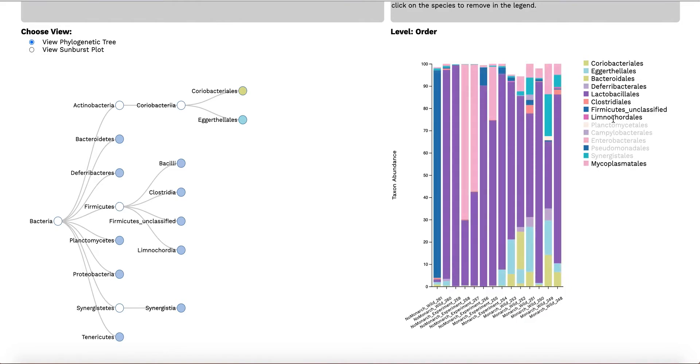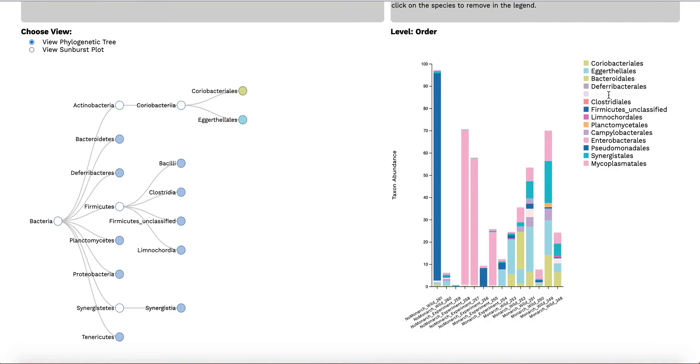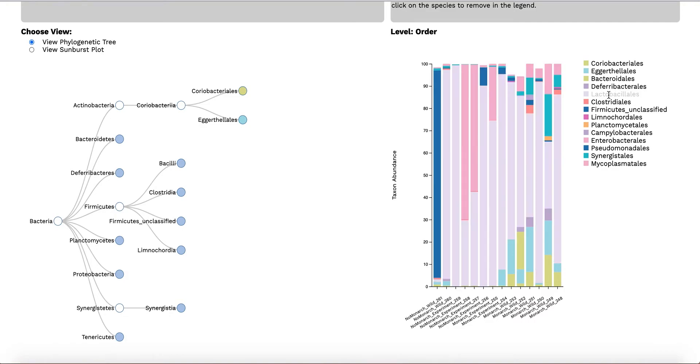Mousing over the species name on the legend will fade it out, clicking on it will remove it, and clicking again will make it reappear.